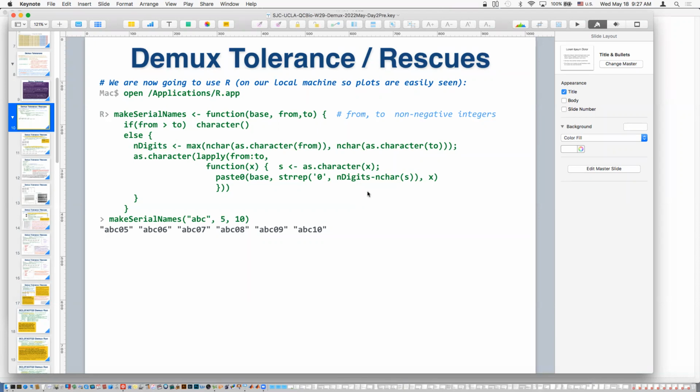Recovery is very easy to do. You do the Demux and you see how much you get out, or you simulate the process and see how much you get out. You don't actually have to write the files out, as long as you count the number that would go if you were to do it. So high recovery is good; all other things being equal, higher recovery is better.